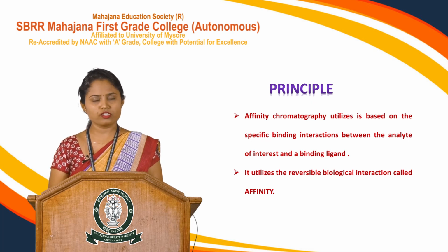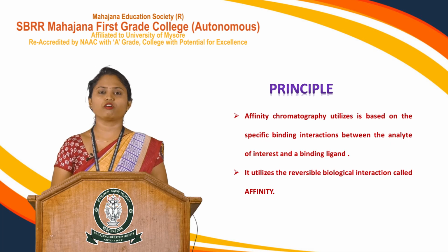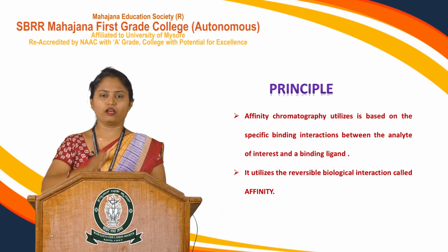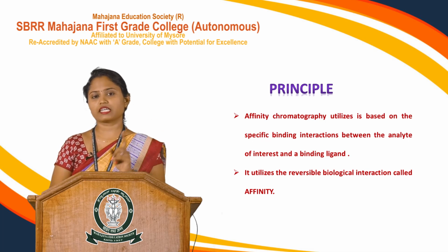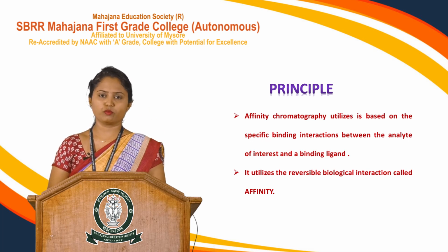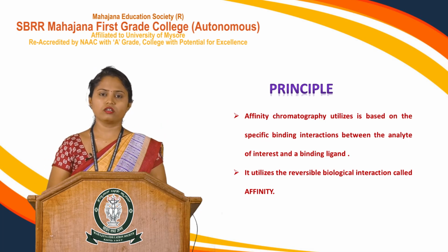And the molecules in the sample which lack the affinity for binding with your ligands elute out of the column, carried by your mobile phase, which means the mobile phase will carry the sample and elute out through the column.